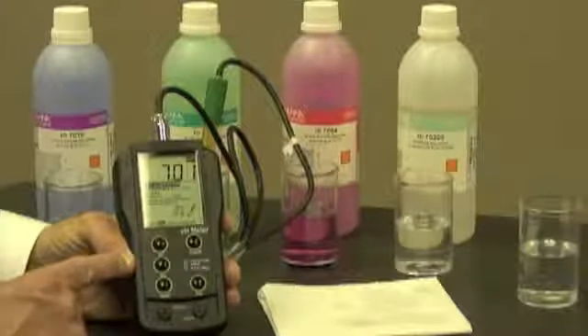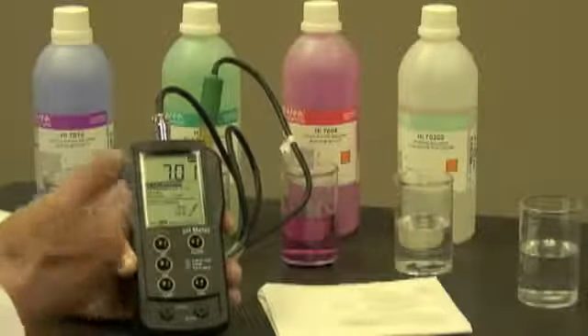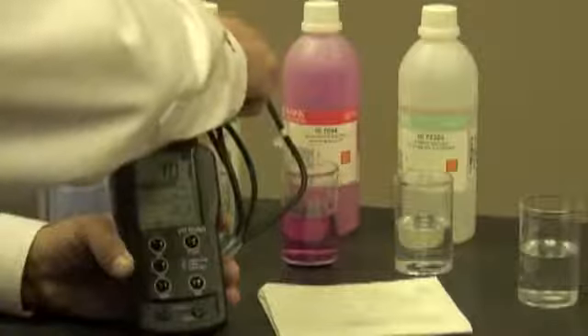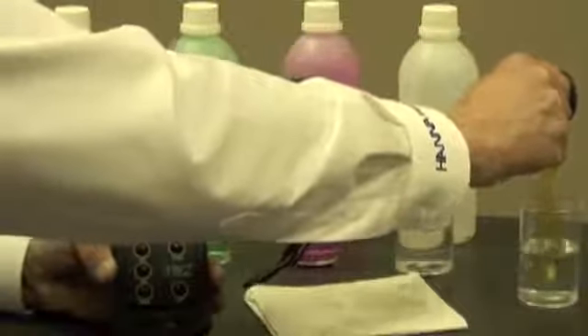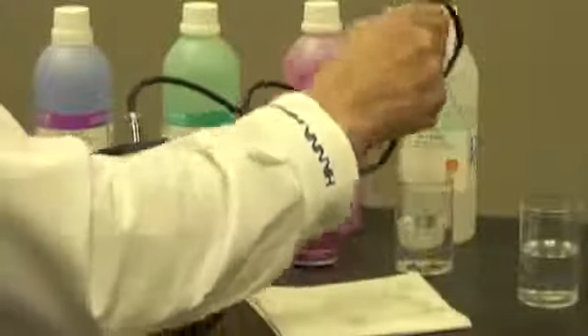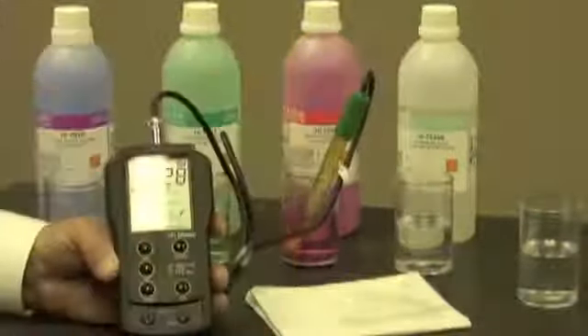Depending on what I'm going to measure — if it's an acid or a base — I'm going to choose either a 4 or a 10 buffer. In this case, since I'm going to measure something acidic, I still want to rinse my electrode off, dry it, and put it into a pH 4 buffer.